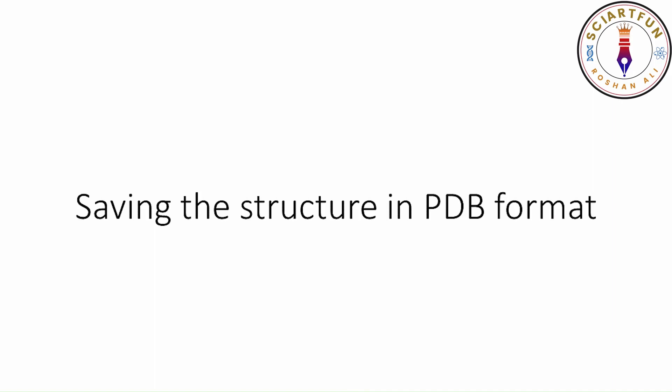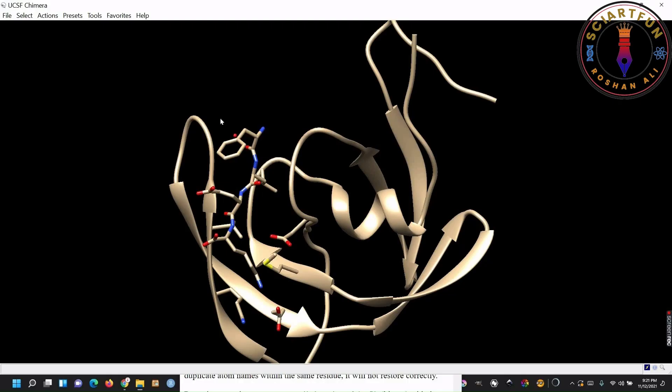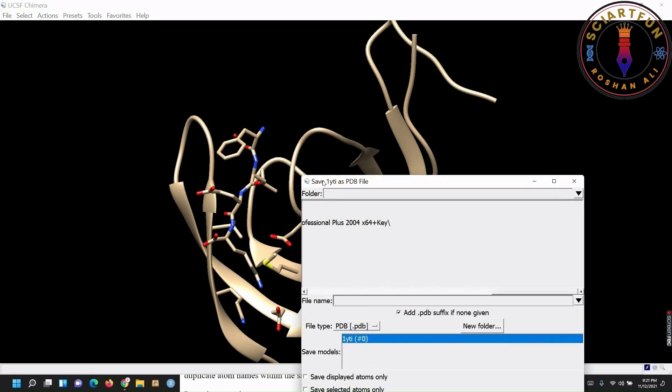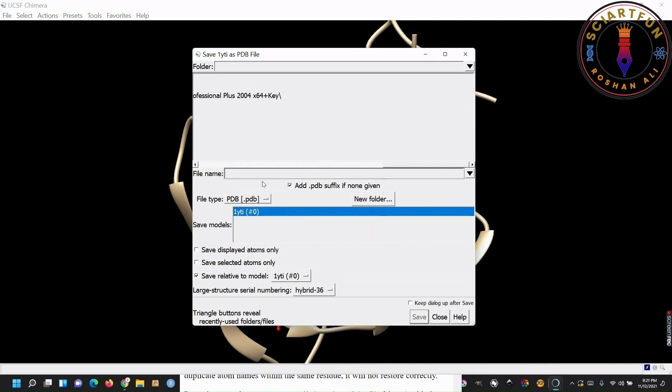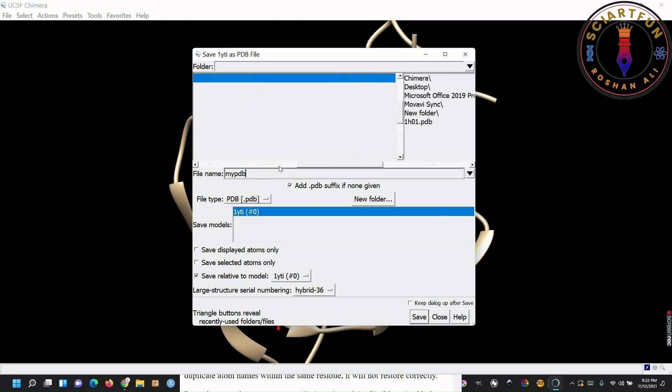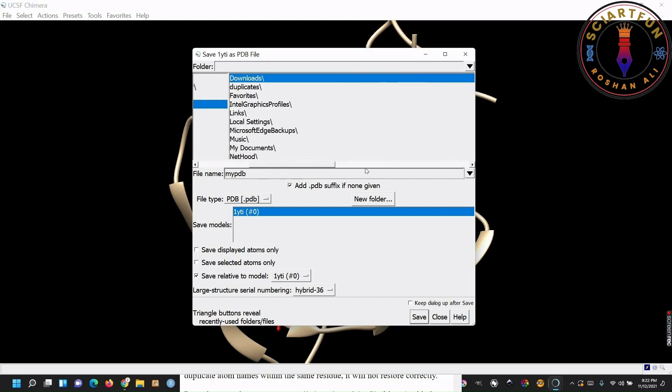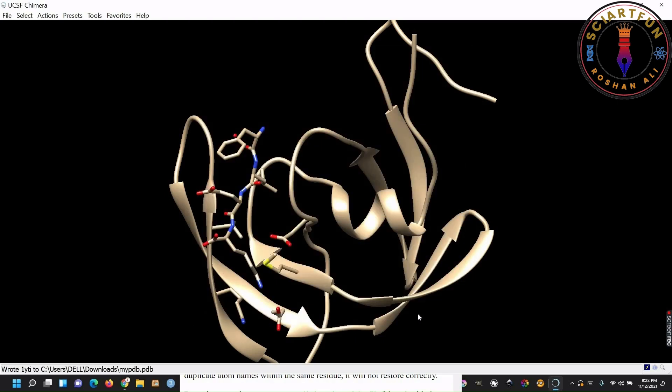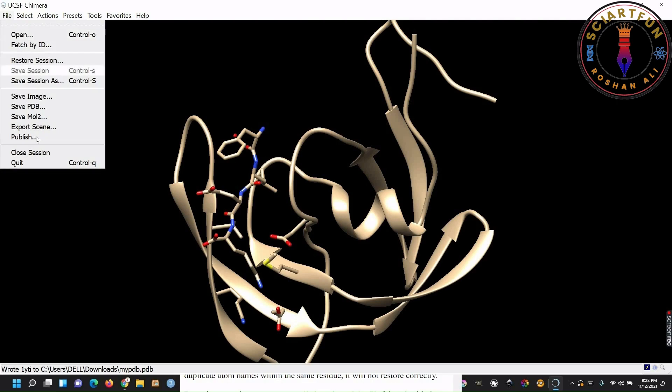Saving the structure in PDB format. For this purpose, go to file, save PDB. Select the location. Name the file and click save. Your structure is now saved in PDB format.